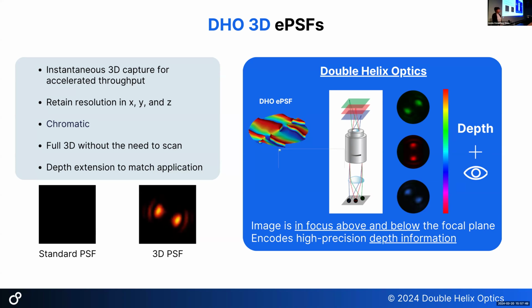You don't have to use deconvolution. In localization microscopy, you're going to use a different algorithm. It depends on what you're studying. If you're doing tracking, then there's no deconvolution, because you just want to see how something moves through time and space. If you're doing single molecule, it's localization microscopy, so you need to localize and calibrate, so that you can identify those localizations and get that XYZ point for each spot.